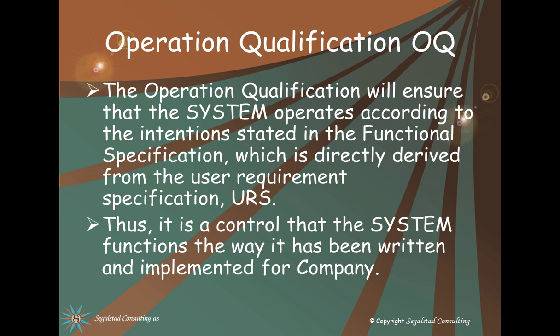The operation qualification, OQ, will ensure that the system operates according to the intentions stated in the functional specification, which is directly derived from the user requirement specification, the URS. Thus, it is a control that the system functions the way it has been written and implemented for the company.